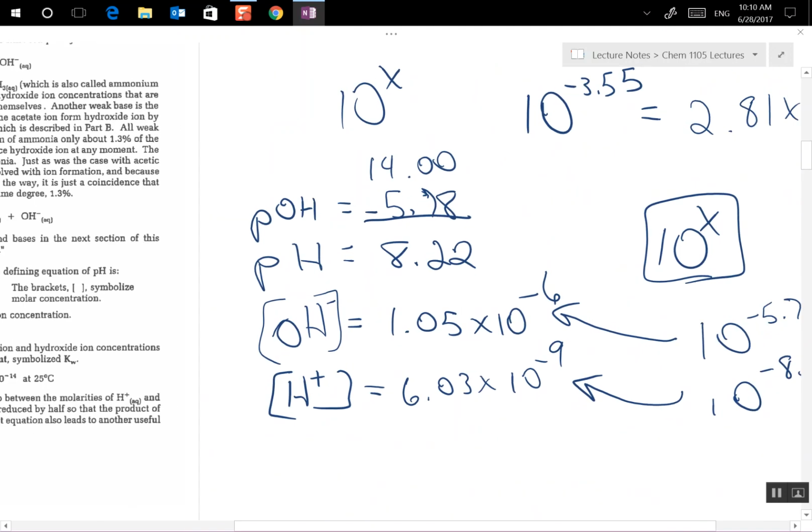Okay, so now if you look at your report sheet on page 241, what you're going to notice is that in part A, you have 4 substances, and you are going to measure the pH of those, okay, by using a pH meter and by using pH paper.